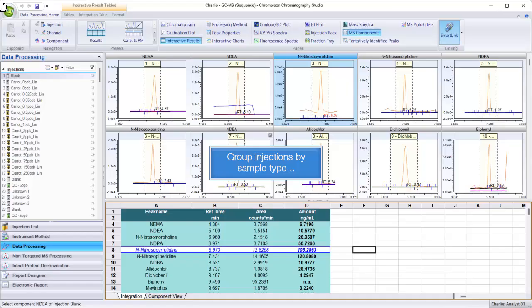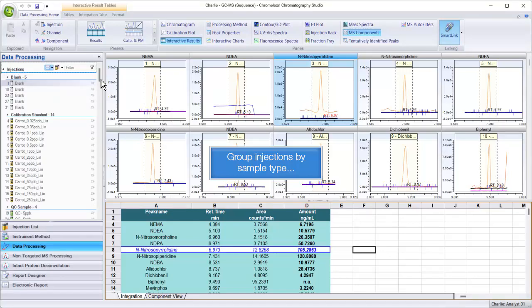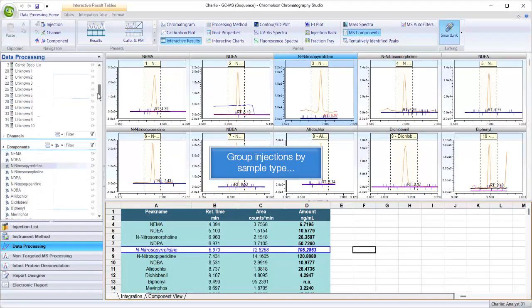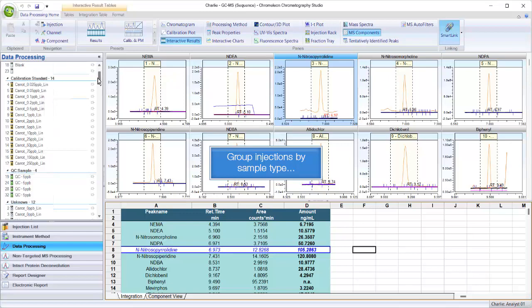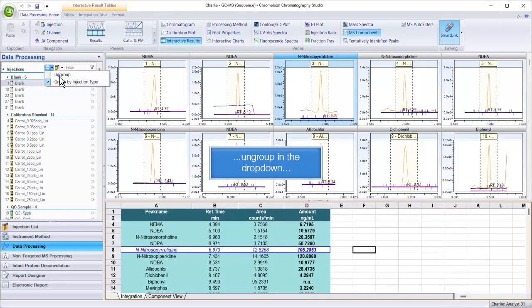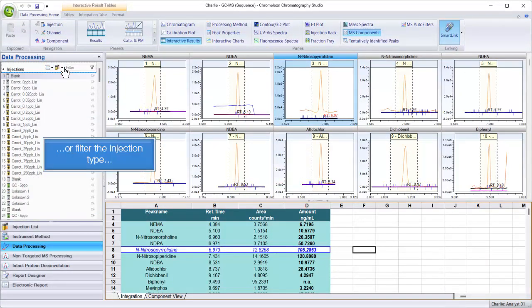Group injections by sample type, ungroup in the drop-down, or filter the injection type.